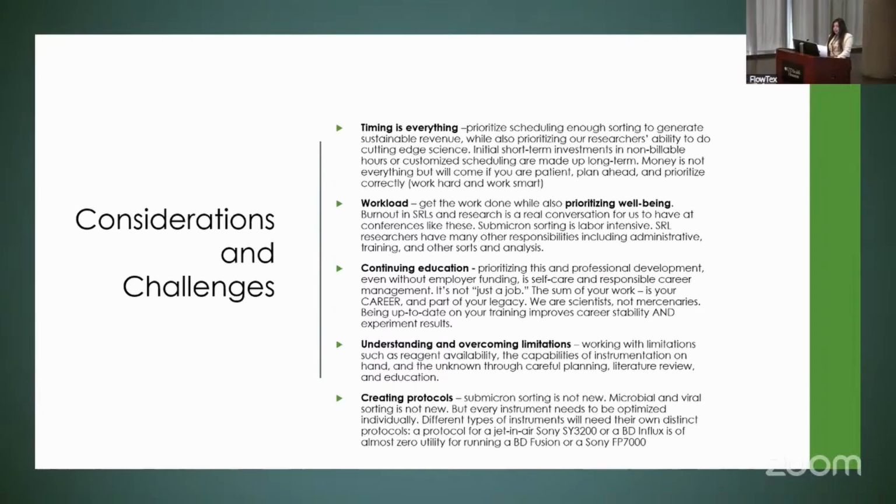Our only work is not just operating the sorter, right? So this is why a conscious, mindful scheduling methodology works. Also, the necessary instrument preparation is mentally and physically demanding, and burnout in SRLs in general is another topic. It's beyond the scope of this talk, and I'm gonna run out of time soon.